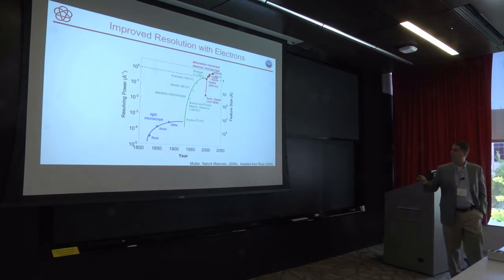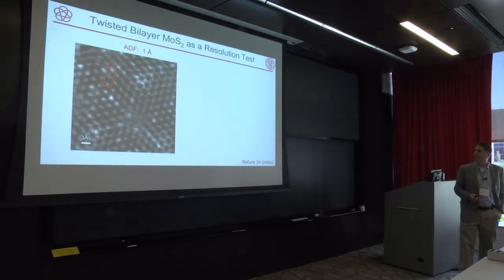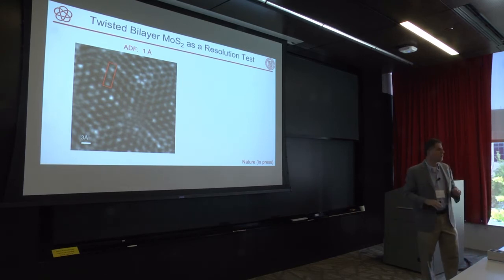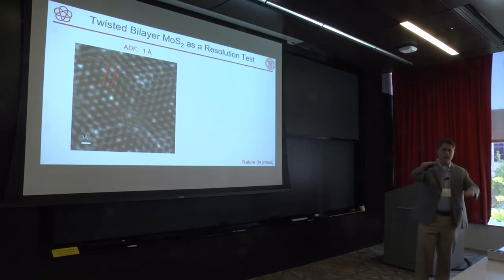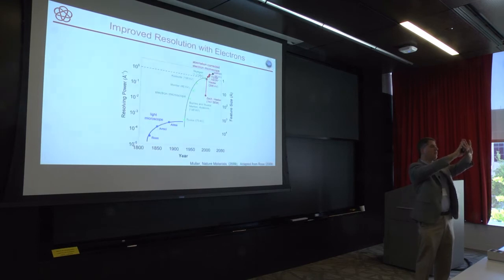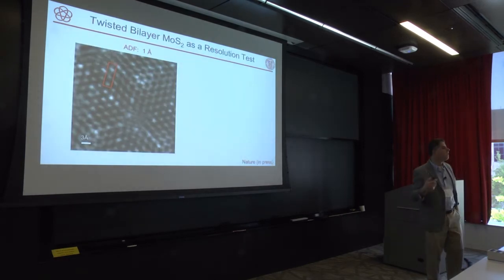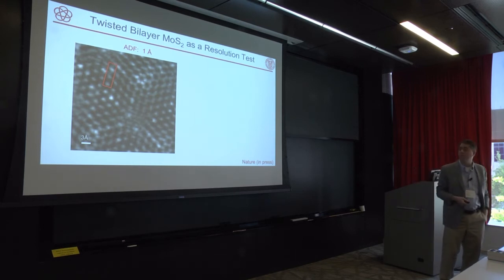And you might ask yourself, if the shortest bond length in nature is an angstrom, why do I want to get below an angstrom? Why does it matter? And so here's a very quick picture. This is MoS2. It's a two-dimensional material, and it's got a hexagonal structure. But if you've been looking at physics today lately, if you take 2D materials and you stack them one layer on top of the other, so the lattices are rotated like that, you get a beautiful moire pattern and very interesting electronic structure, particularly when the rotations of the moire fringes are incommensurate with the lattice.